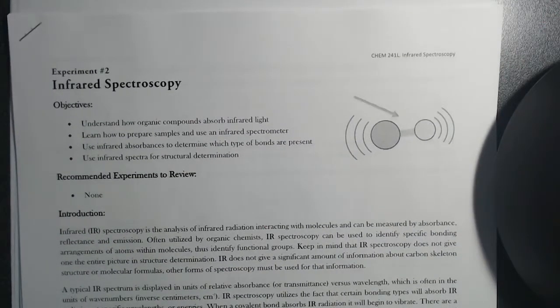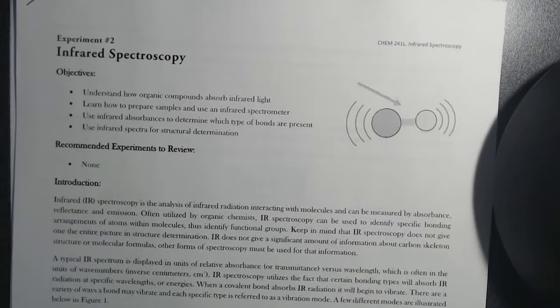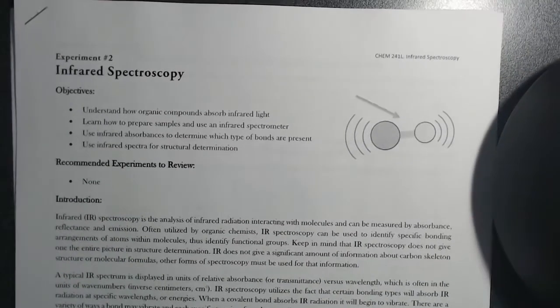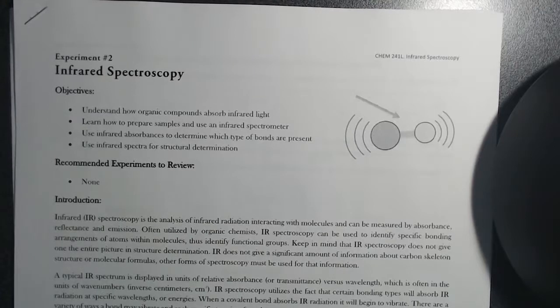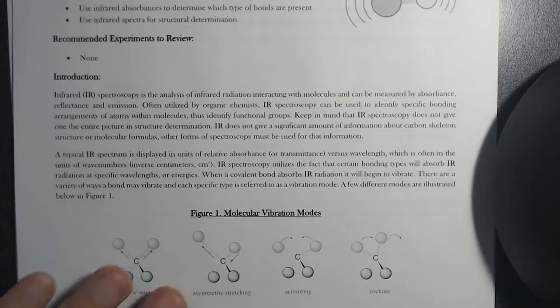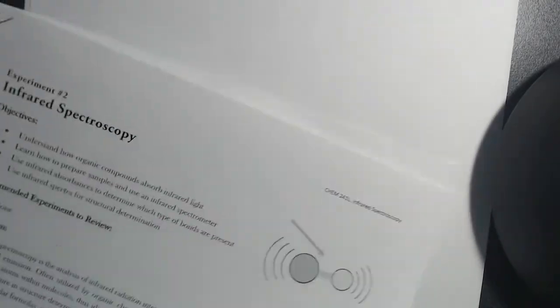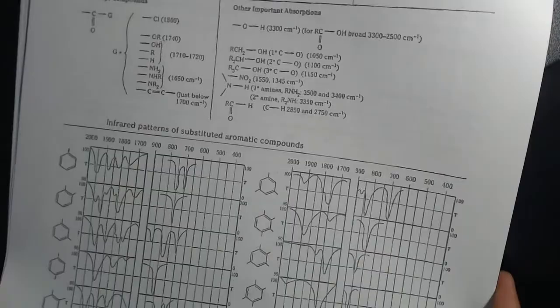This is actually the lab from Canvas. I recommend printing this out soon if you have not done so already. The reason why I recommend printing it out is because it has a summary of last Thursday's lecture in here. It goes over what's causing the IR, little details. You have your little summary here, the chart. And then you also have these crucial pieces of information. You have the correlation charts, which you are going to want.